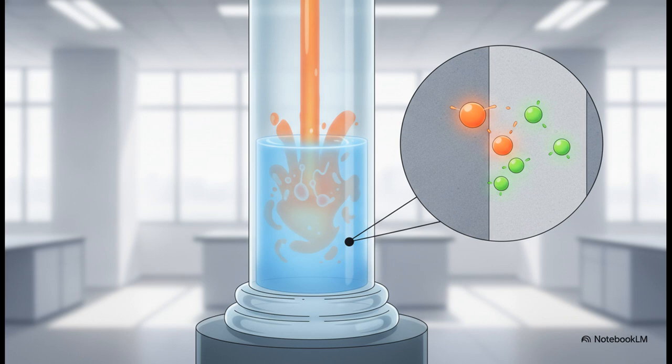So scientists actively layer in secondary solvents, which are polar, things like ethyl acetate or methanol. These secondary solvents act as competitors. They actively fight our sample molecules for those magnetic spots on the silica, effectively kicking the sample molecules off the wall and washing them right down the column.